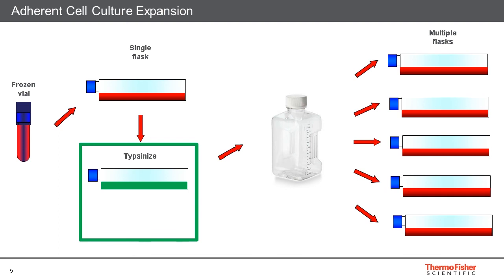So obviously in the area of vaccine manufacturing, for instance, you are maybe familiar with the general steps of growing adherent cells by a system of multiple flasks, with the cells able to adhere to the substrate. And this is obviously proven, relatively old technology, which comes with slightly more modern options.